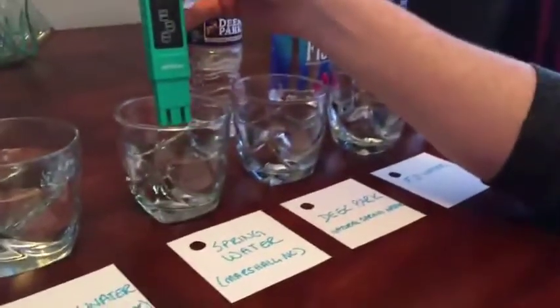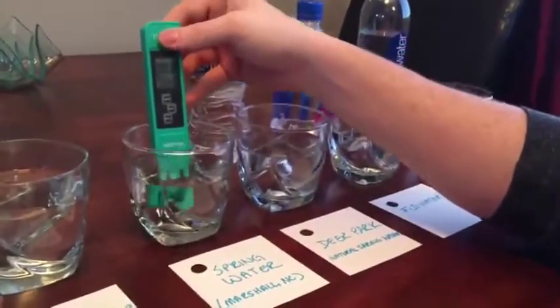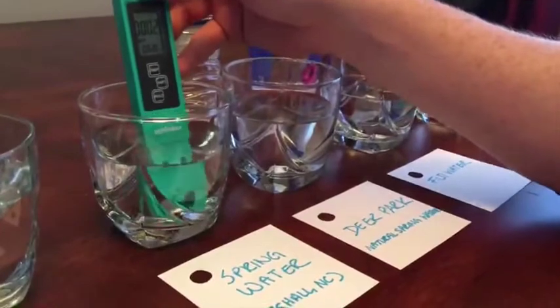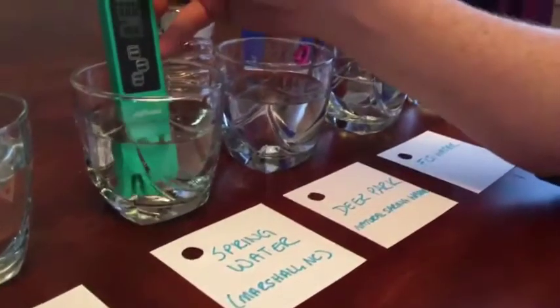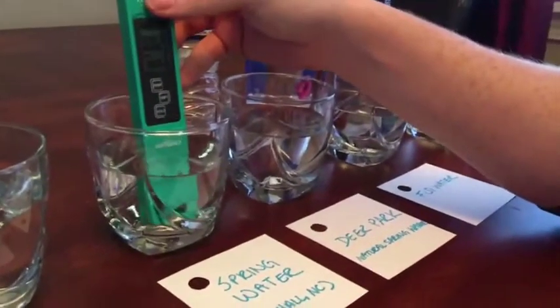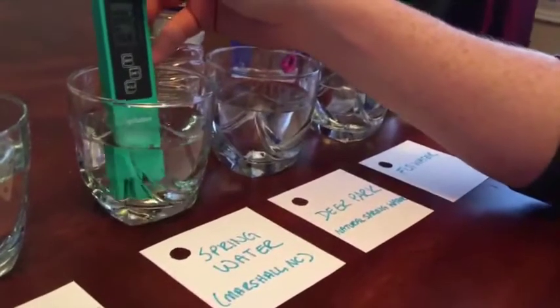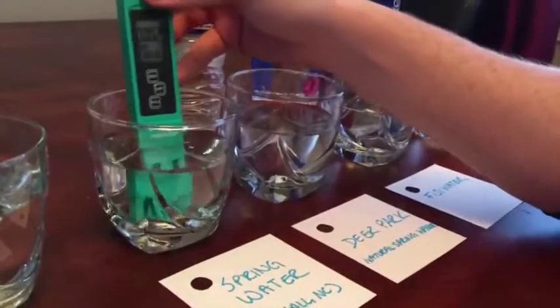All right, so we're going to go ahead and test spring water, which is from the next town over. It's about 40 minutes away, and this is natural spring water. And if you look at that, remember how I said 0 is ideal for clean water? This is 2 parts per million. This has got no filter. This is nothing, coming straight out of the ground in Marshall, North Carolina. It's mountain spring water, 2 parts per million.